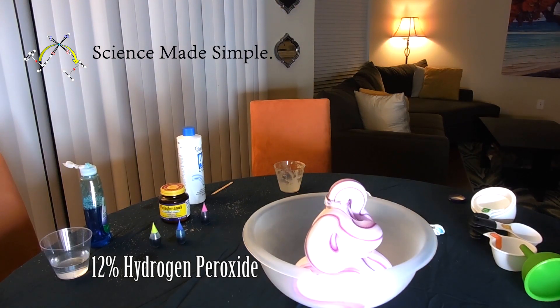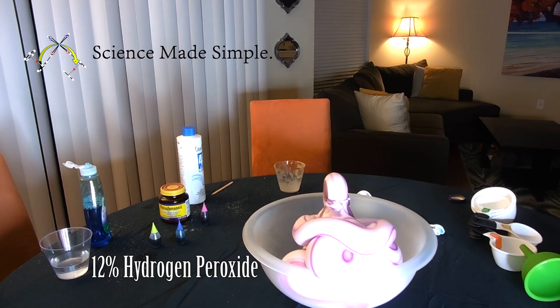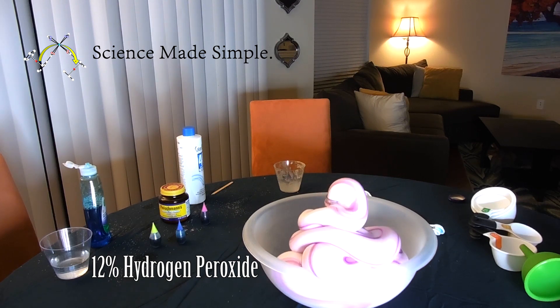And there it is — elephant toothpaste! Now this reaction will go on for a couple of minutes, but once it's over, you may want to wait a few minutes before cleaning it up because it is exothermic, which means it gives off heat.